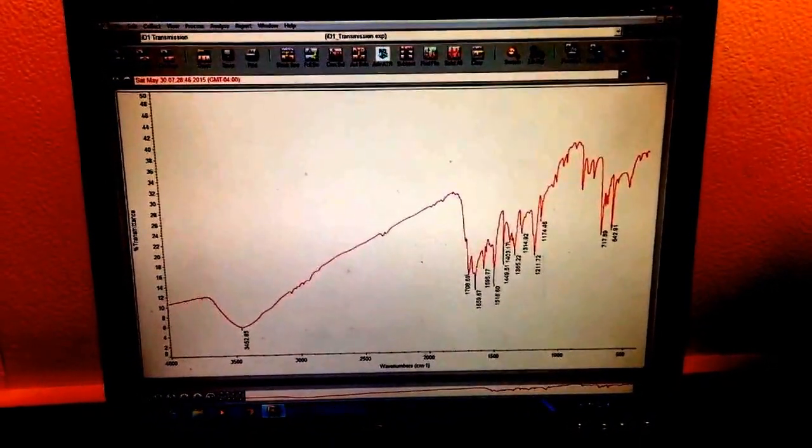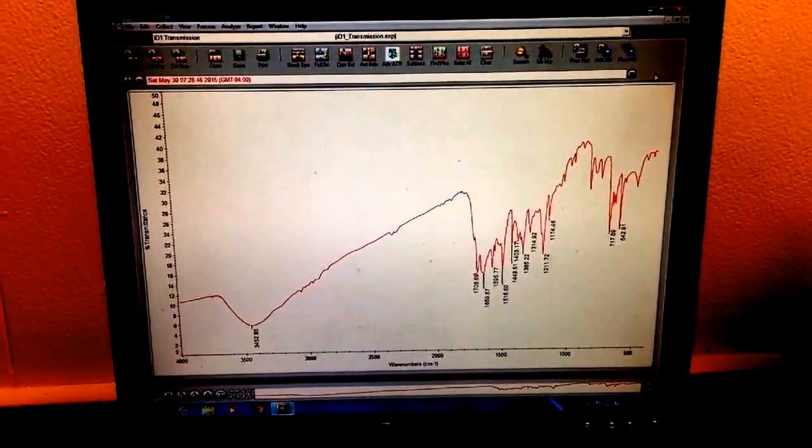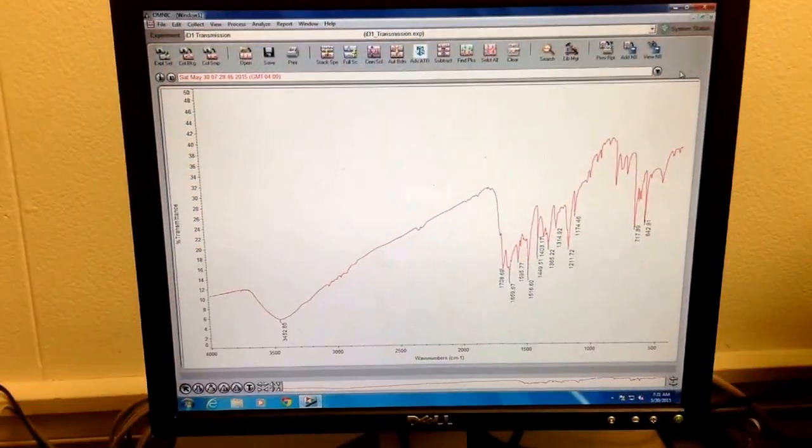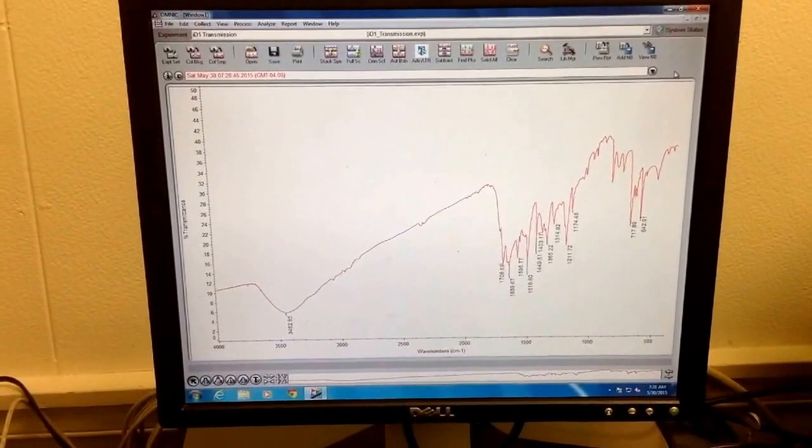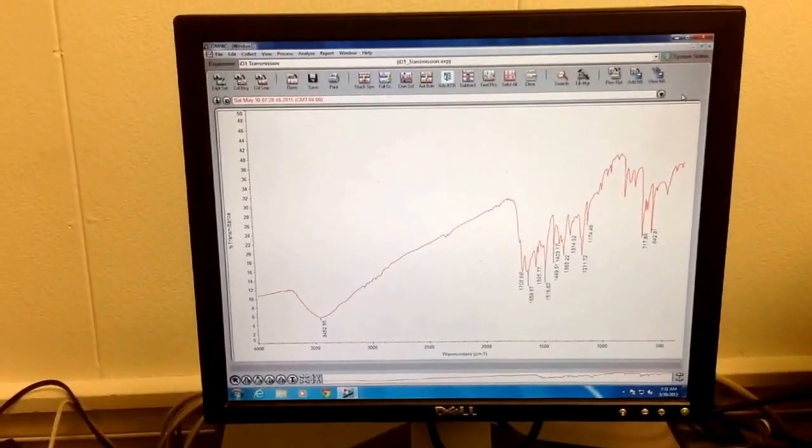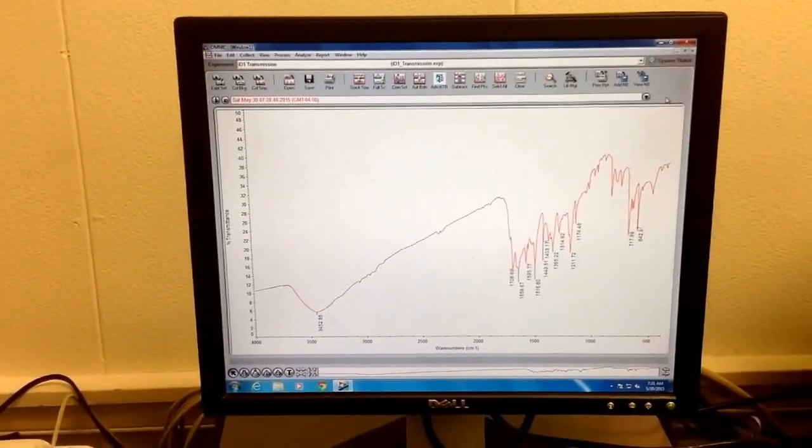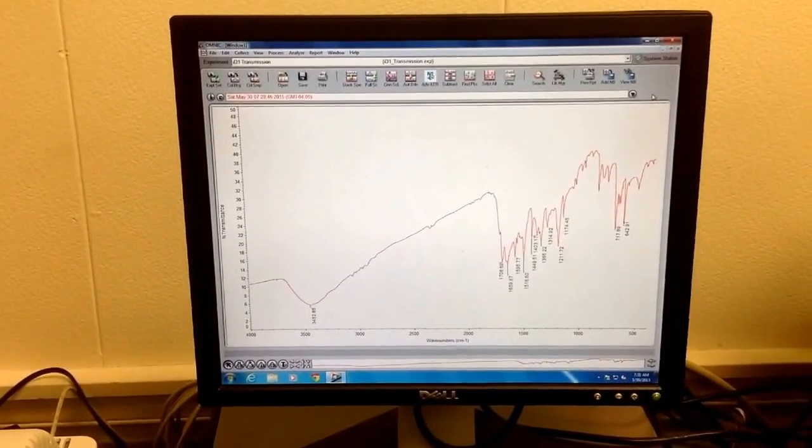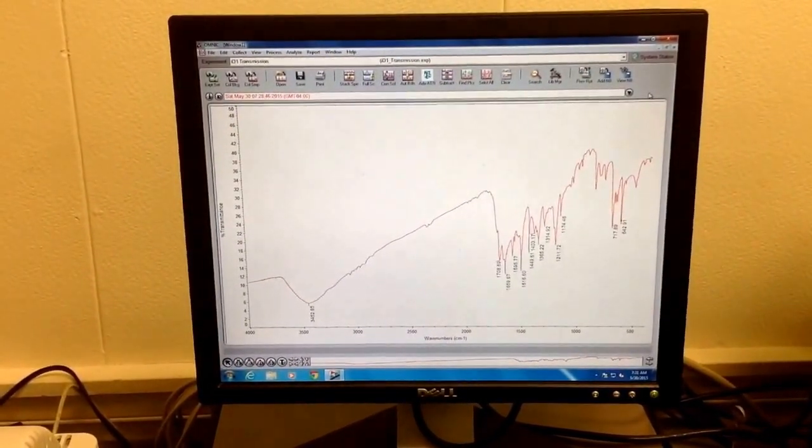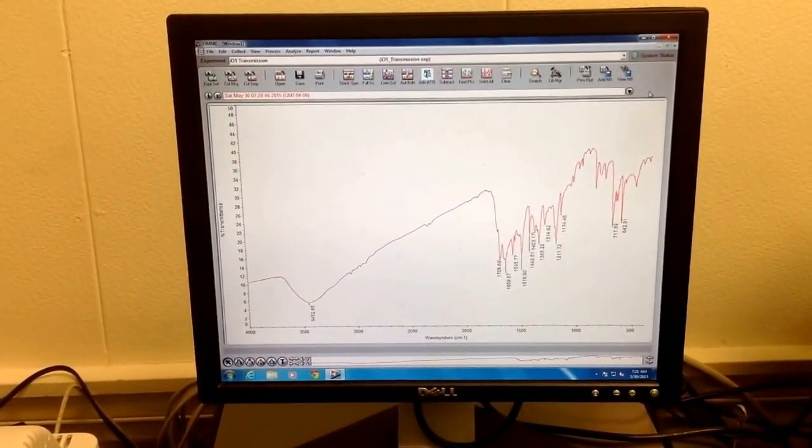And then we can save it with our software. Oftentimes, with software, you can export it to something like Excel, so if you need to include it in a lab report or something. Anyway, this concludes these two videos on collecting transmission IR spectroscopy spectrum. Thank you very much. Have a great day.